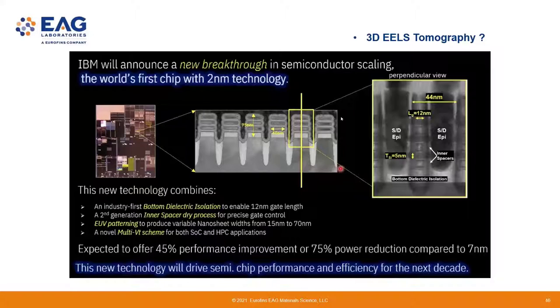Yeah, if I have a choice, for tomography I always want to do a needle type of atom probe geometry, right? That will make your data interpretation much easier. For engineering problems, especially if you are working in the semiconductor industry, you don't have time to collect a very, very large data set with the best spatial resolution. That's not the purpose, right? You can probably still use the two-dimensional planar type of sample, right?